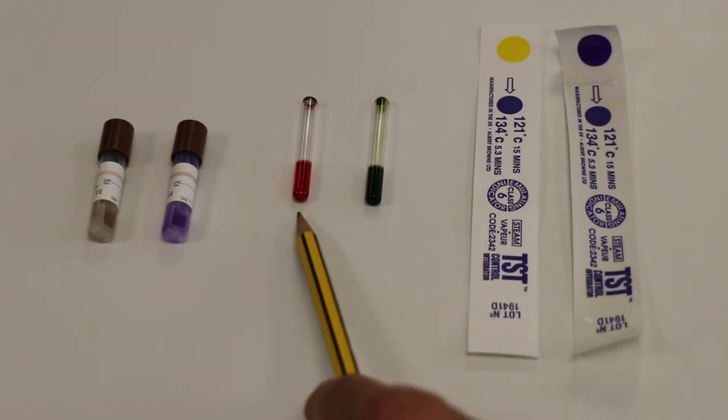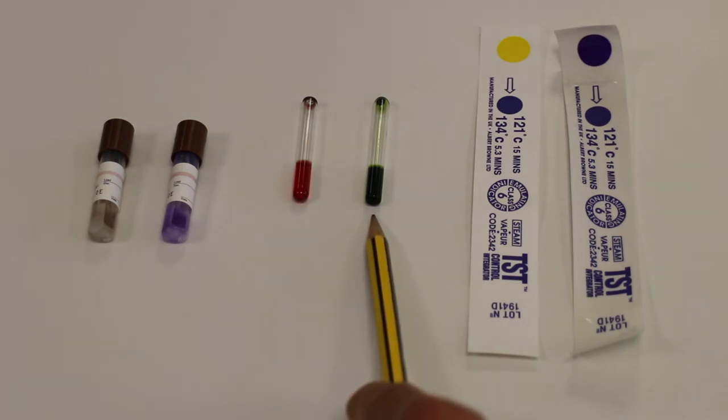This was the browns tube before it had been autoclaved and this was after it had been autoclaved, indicating a positive result.